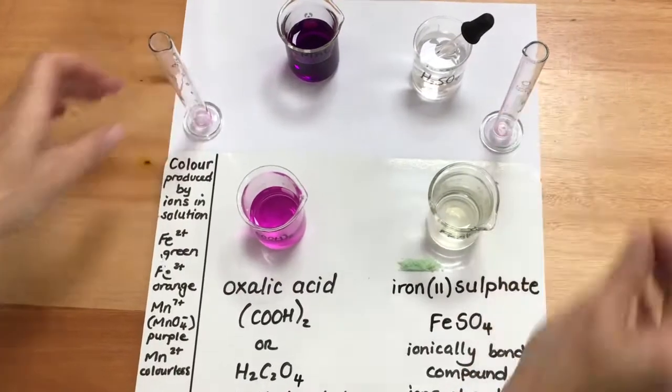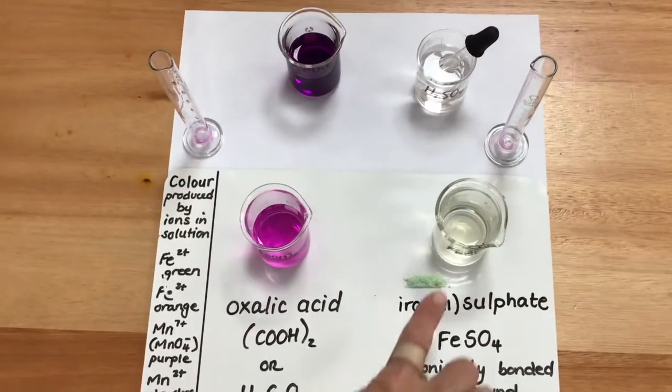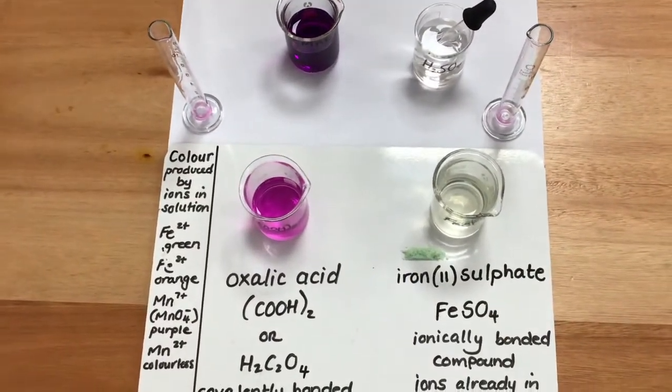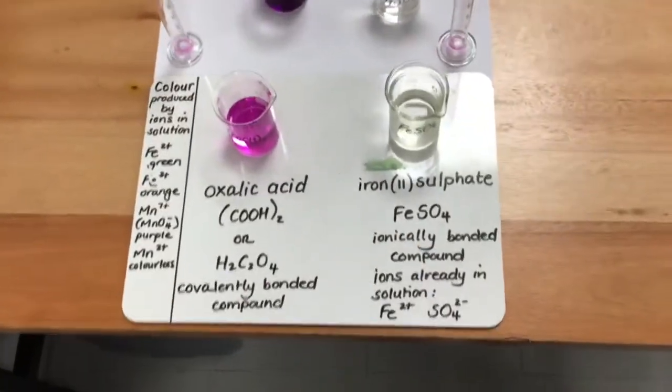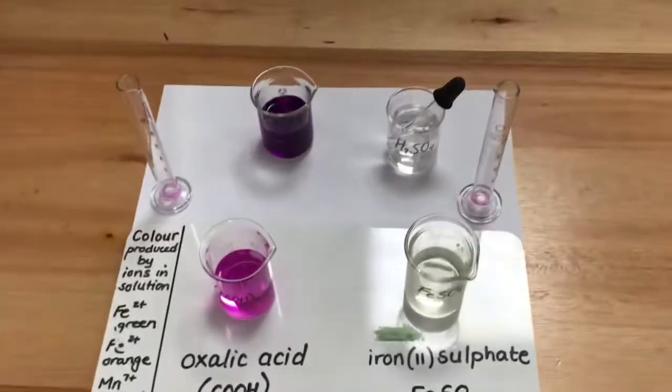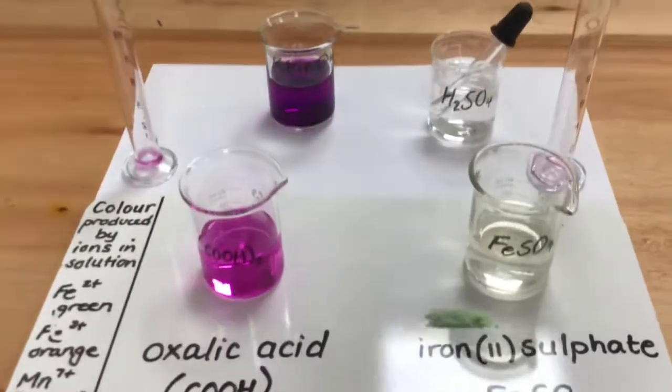You notice that the purple solution turned colorless immediately in the iron(II) sulfate solution, showing that the reaction between iron(II) sulfate and potassium permanganate was very rapid.